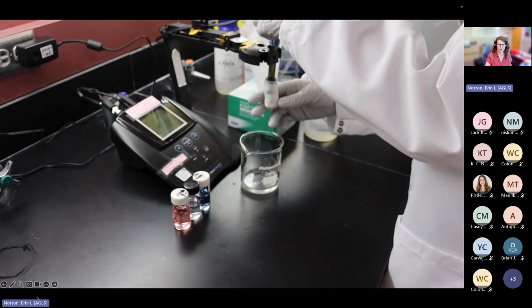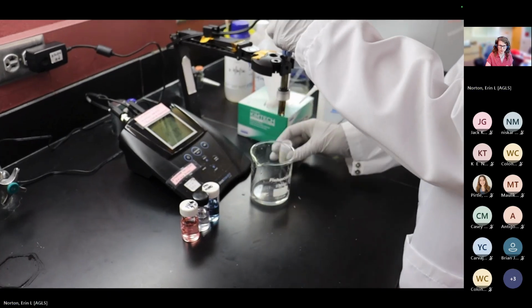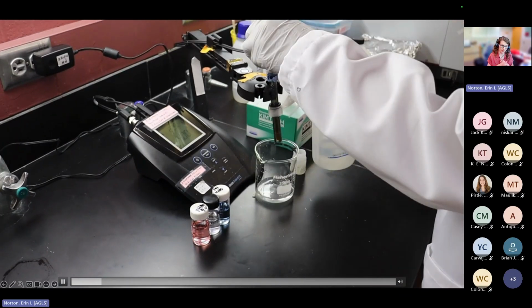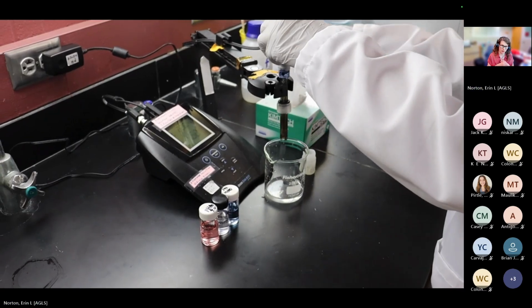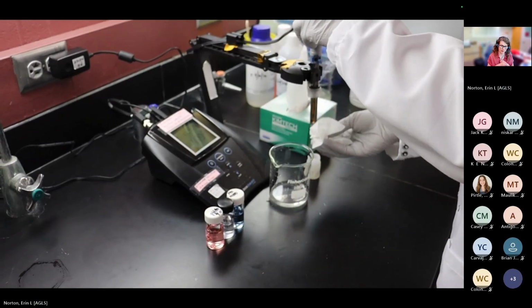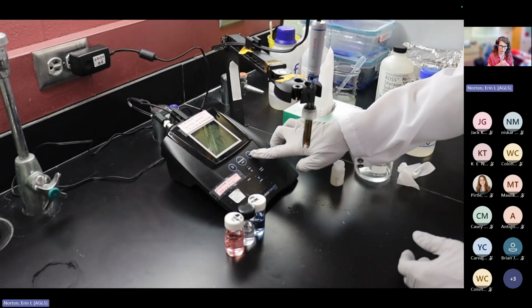Okay, so we're removing the probe from the storage solution. On our particular probe, we do need to open the little valve for the pH probe to work. Rinsing it with water. Again, always have a beaker for waste, blotting it dry, making sure that the water is removed.